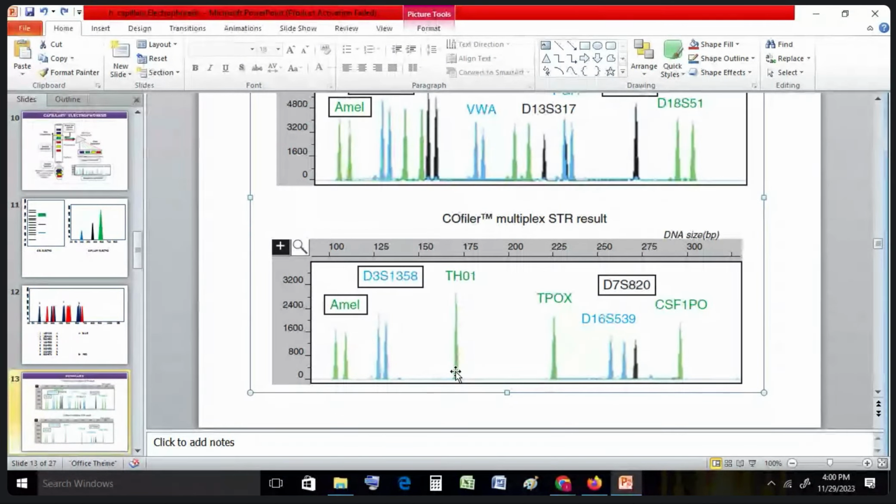Exactly. কারণ আমাদের মধ্যে there are only 2 possibilities. I can get the same number of repeats from my mother and father, so I will be homozygous and produce a single peak for a specific locus. I can get at most 2 different repeats from my mother and father. দুইজন থেকে দুইটা ভ্যারিয়েশন পাইতে পারি, তিনটা তো পাইতে পারি না. So I can produce 2 repeats or 2 peaks in a specific locus.